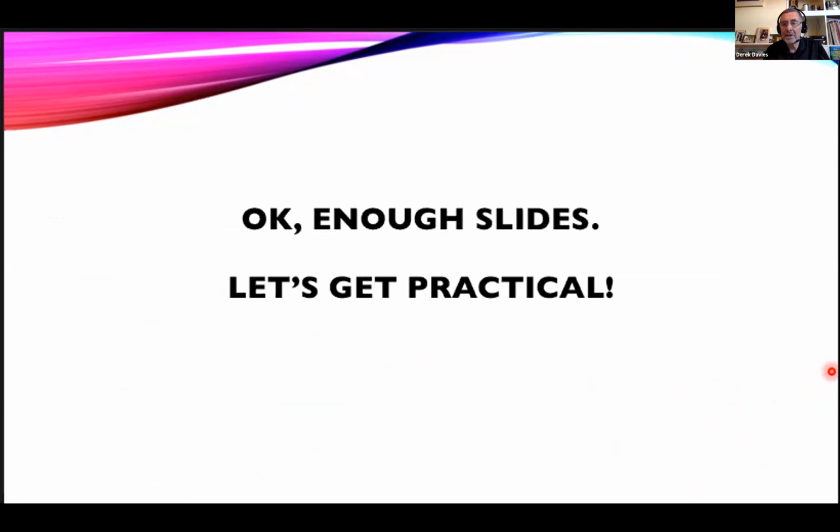I'm going to hand you over to Kathy now, who's sitting in front of the Fortessa, and we're going to run through the QC. Yes, Kathy, before you start, we actually have a question here that I think is quite pertinent. Somebody's asking if you can't see the peaks, does it denote a problem with the cytometer, or is it just the property of the fluorophore?